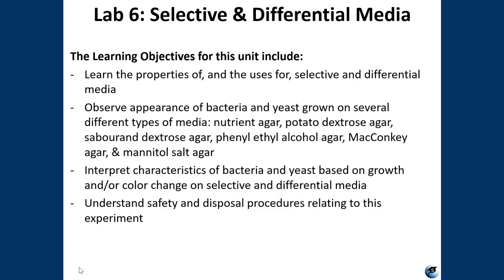The learning objectives for this unit include learning the properties of and uses for several different types of selective and differential media. You're going to observe the appearance of bacteria and yeast grown on these different types of media, including your regular general growth media, nutrient agar, potato dextrose agar, also known as PDA, Sabouraud dextrose agar, also known as SDA, phenylethyl alcohol agar, also known as PEA, Mannitol Salt Agar, MSA. You're also going to learn how to interpret the characteristics of bacteria and yeast based on how they grow or how they look on these different media.